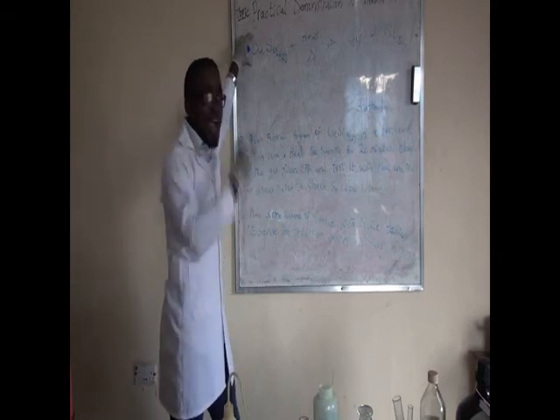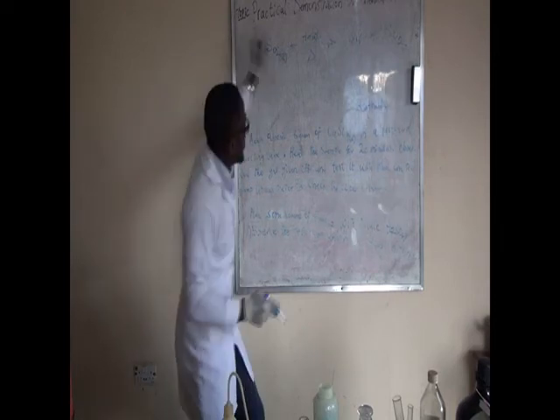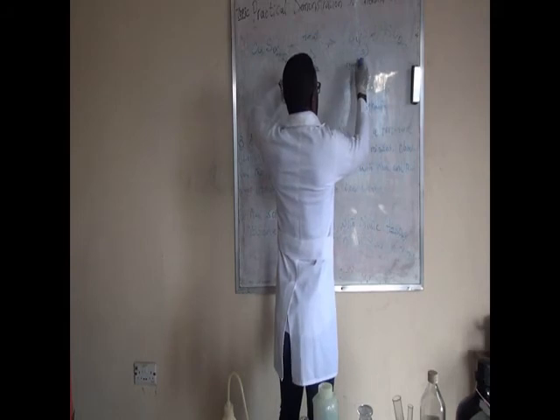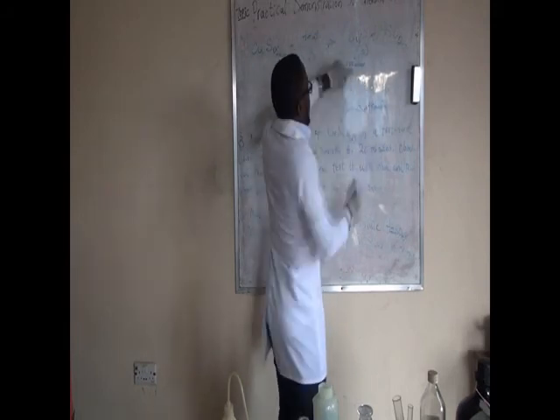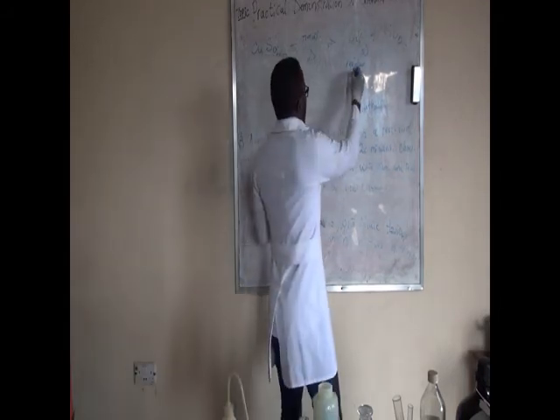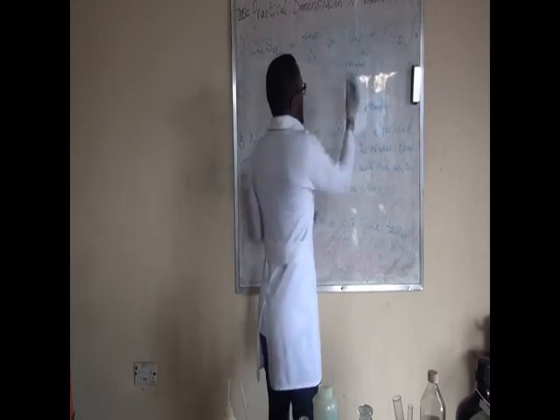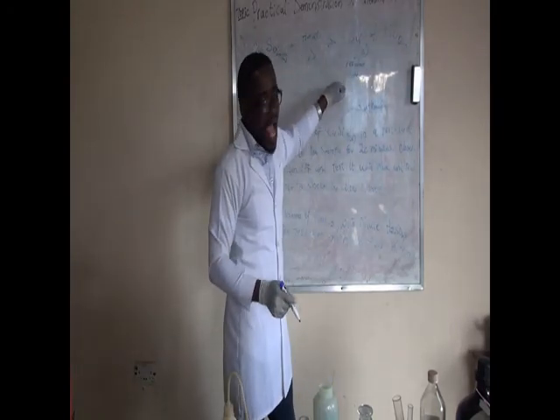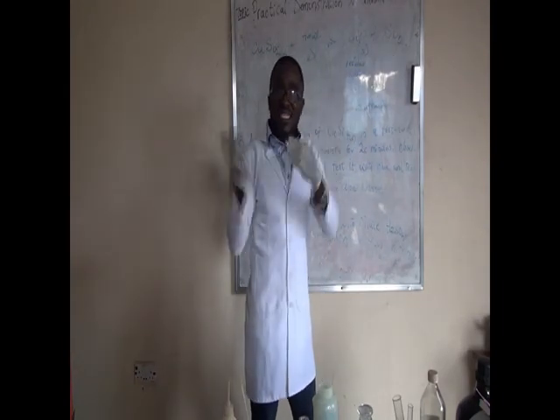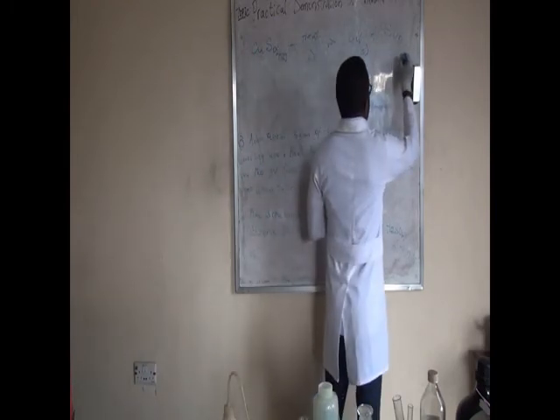Remember, we have A being decomposed to give B and C. Here we have a solid. This solid becomes what? A residue. A white residue, which was observed at the bottom of the test tube. The copper changes its color immediately to what we have here. Whereas the sulfur 4-oxide was the gas that we were trying to wave away to observe. So this becomes what? A gas.